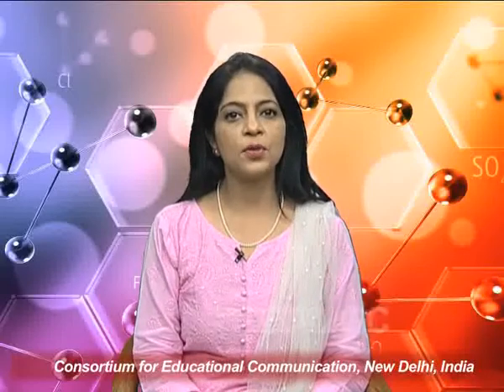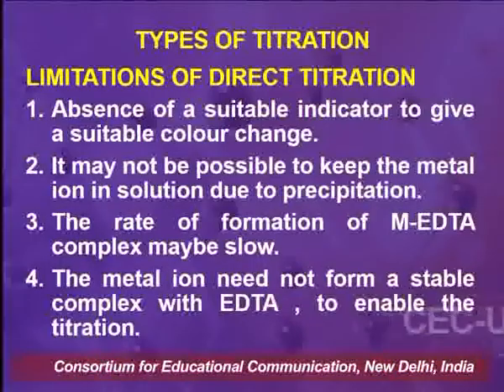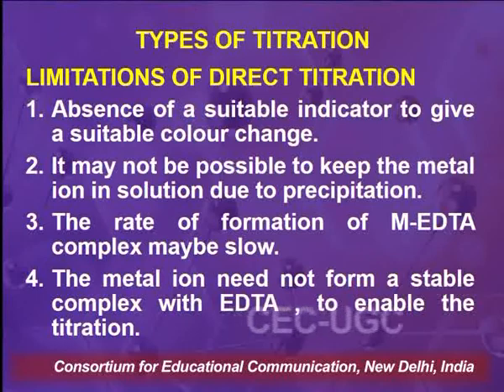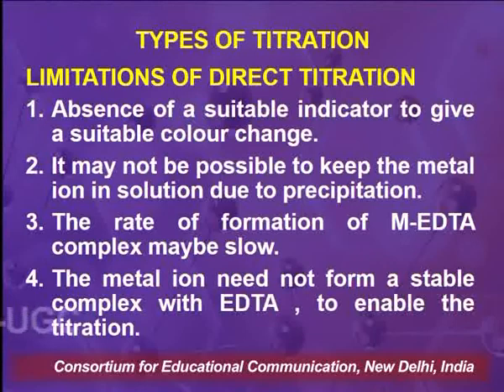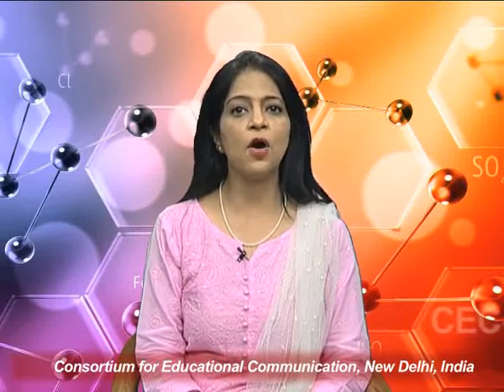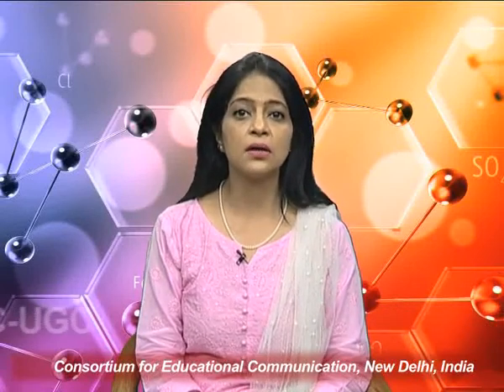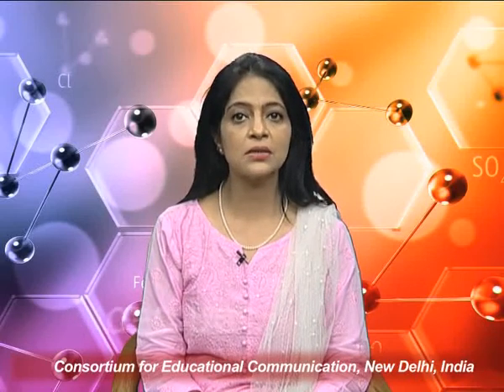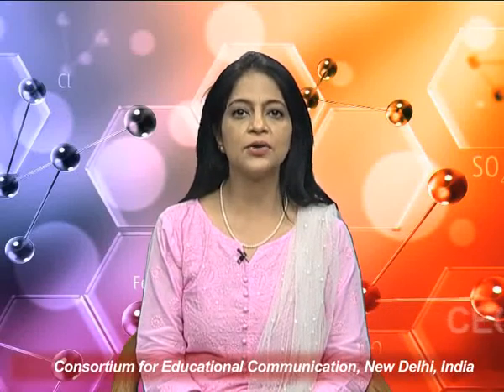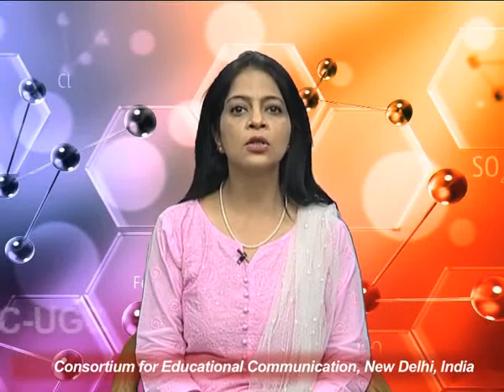The rate of formation of the metal EDTA complex may be slow, and if this happens, then a large volume of EDTA will be required, and the metal indicator complex will not break easily to form the metal EDTA complex. Another limitation is where the metal ion does not form a stable complex with EDTA to enable the titration, and once a stable complex with EDTA does not form, the titration will not proceed.